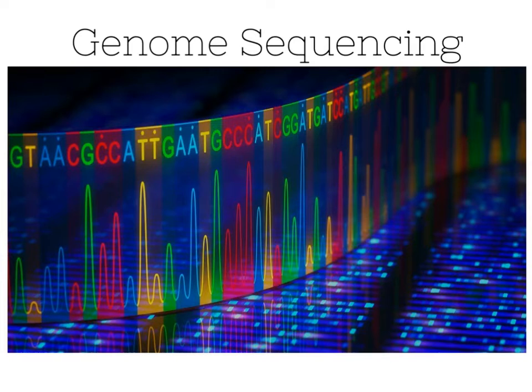So as a result of a genome sequencing experiment, one would generate this sort of trace where the different colors of peaks in this representative trace correspond to the different nucleotides as listed above, enabling us to put together a portion of the genome of an organism.